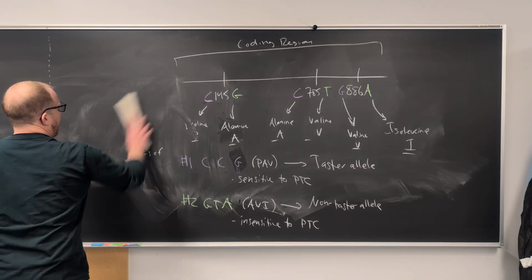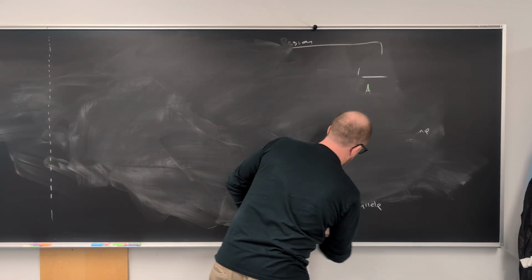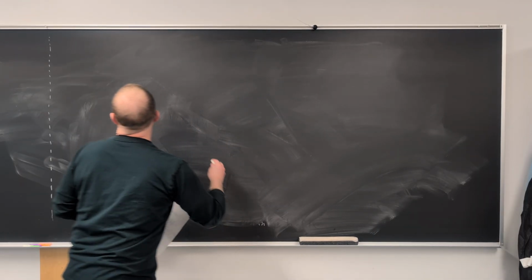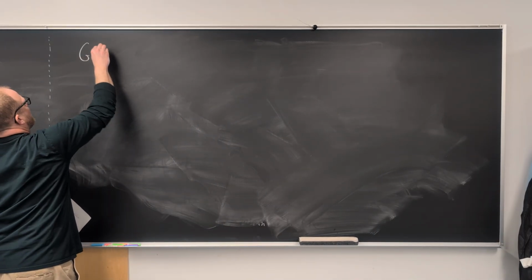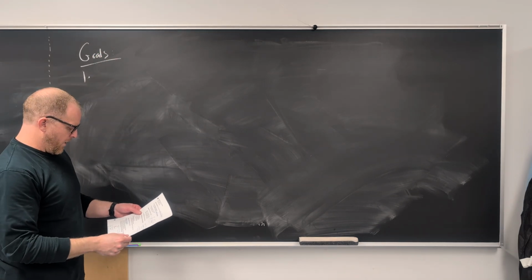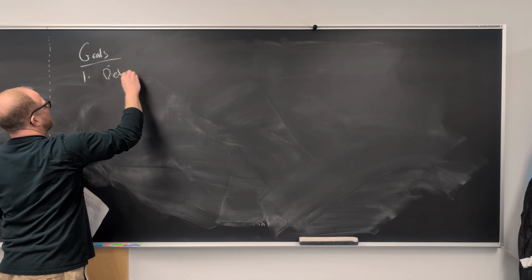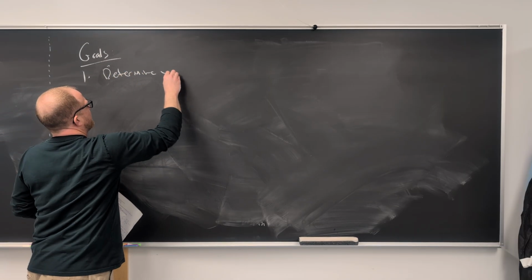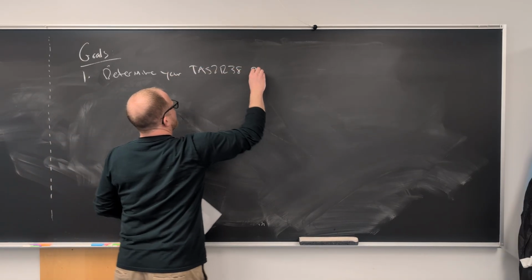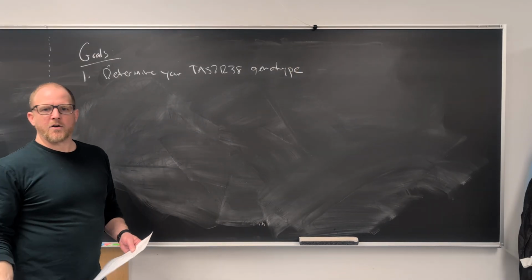So with that said, what is our goal here? Our goals are twofold. Number 1, our goal is to determine your TAS2R38 genotype. That's our primary goal.